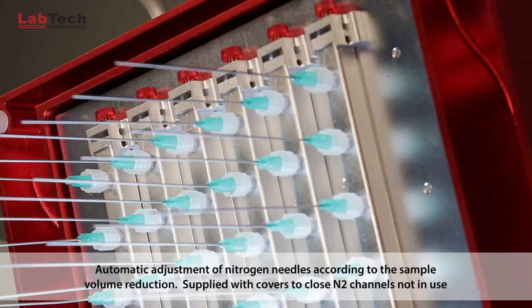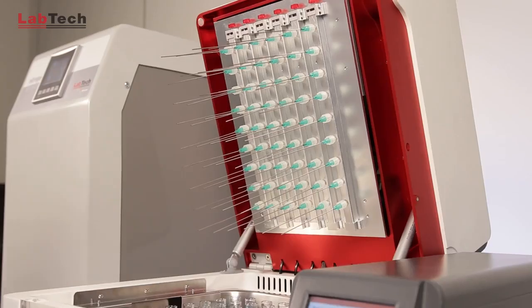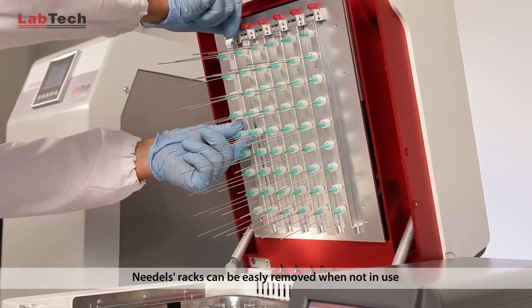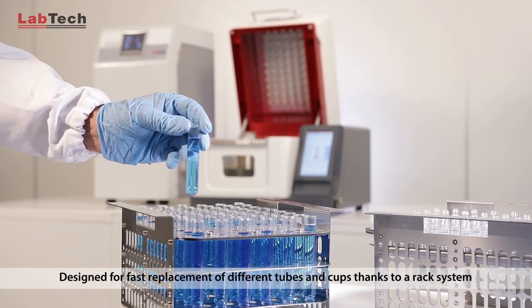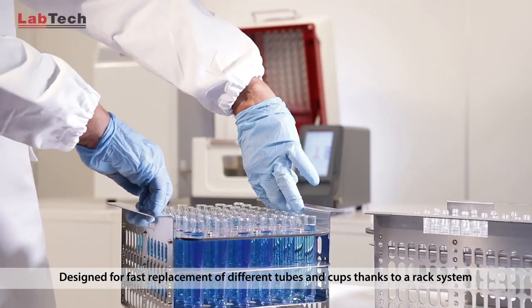Channels not in use can be closed thanks to handy covers for N2 saving. Needle racks can be easily removed when not in use. The instrument is designed for fast replacement of different tubes and cups thanks to a rack system.